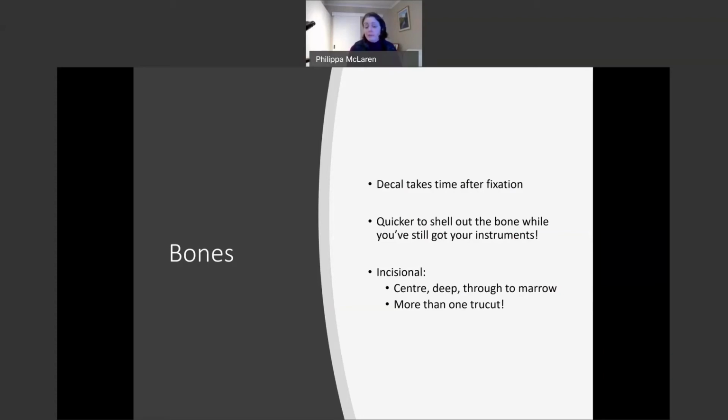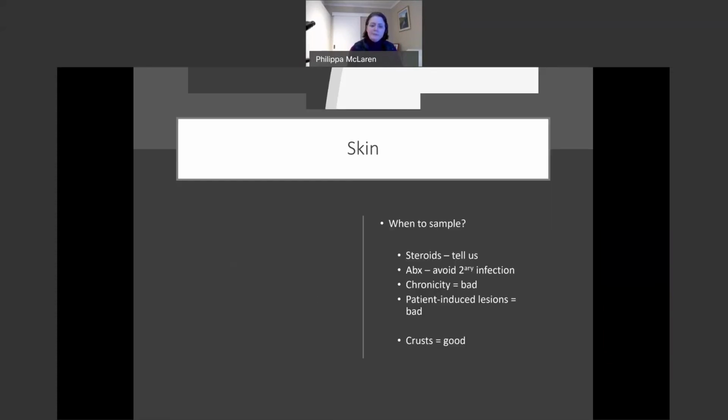For cytology, the only benefit of bone FNA when you're concerned about a sarcoma or osteomyelitis is in differentiating inflammation and neoplasia or reactive. Can't really go much further than that. When you're taking true cuts or Jamshidis, give us more than one if you can. The more you give us, the more likely we are to be able to get a diagnosis, bearing in mind the clinical limitations.